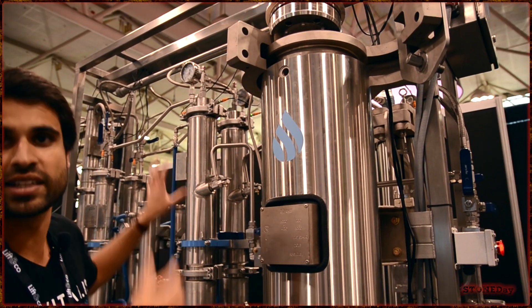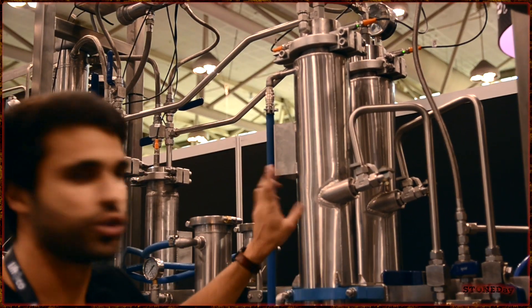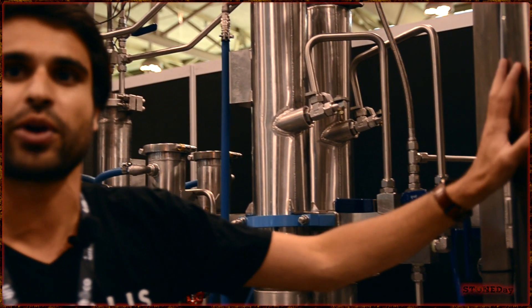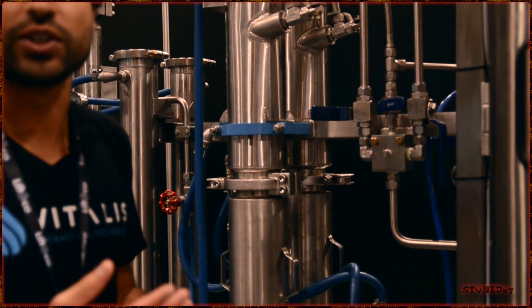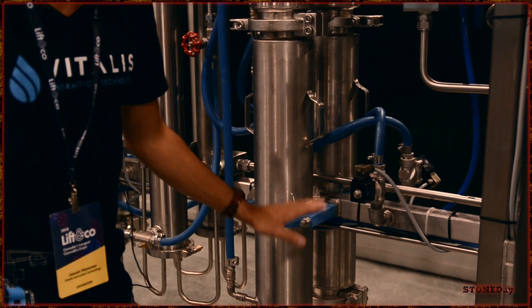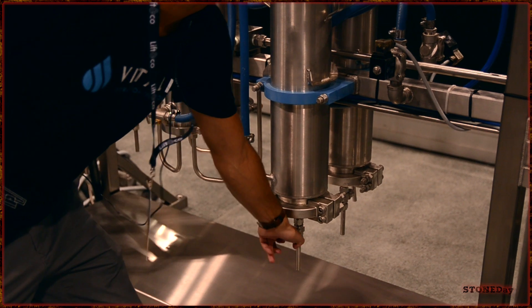Supercritical CO2 goes through here, picks up cannabinoids and terpenes. Everything from here makes its way to the cyclone separator. A needle valve will shoot it into a cyclonic path, and this is a low-pressure environment. Normally this is the higher-pressure environment, but when you go to low pressure, all that semi-liquid supercritical CO2 flashes to a gas, and everything that's dissolved in it drops down to the bottom — cannabis oils, your THCs, THCA, CBD — everything ends at the bottom. And then you can just extract it out with the nozzle here.